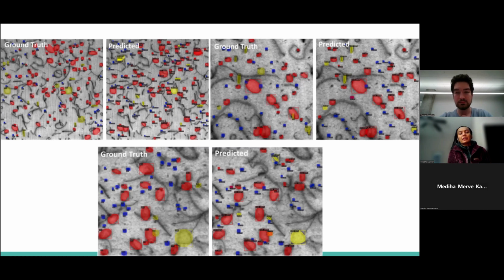Right. My thing is that here you have to provide the bounding box plus the mask, and then you are getting that kind of information. So what is the advantage of giving the bounding box? In terms of the annotation or in terms of the output? Yeah, in terms of anything. Like, we already know the size by the color itself. I don't know in terms of annotating it.